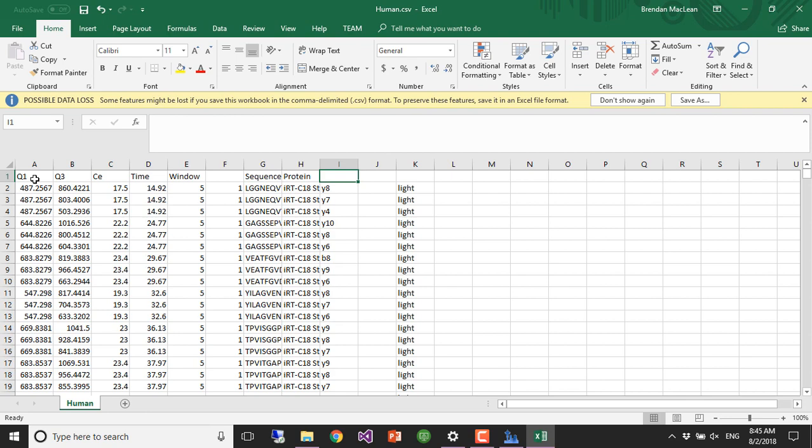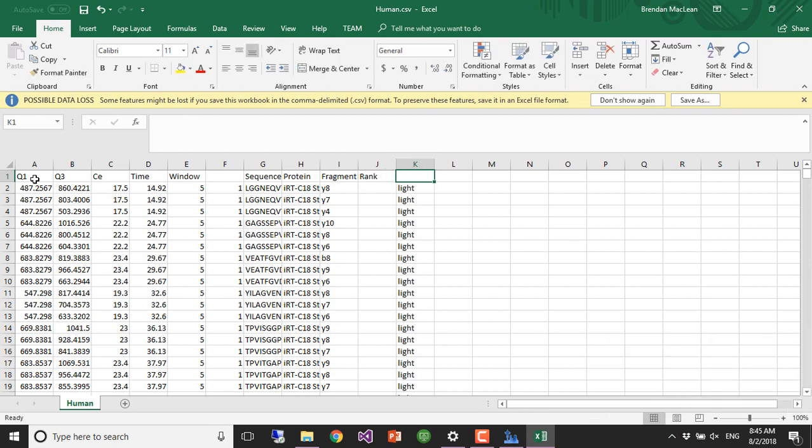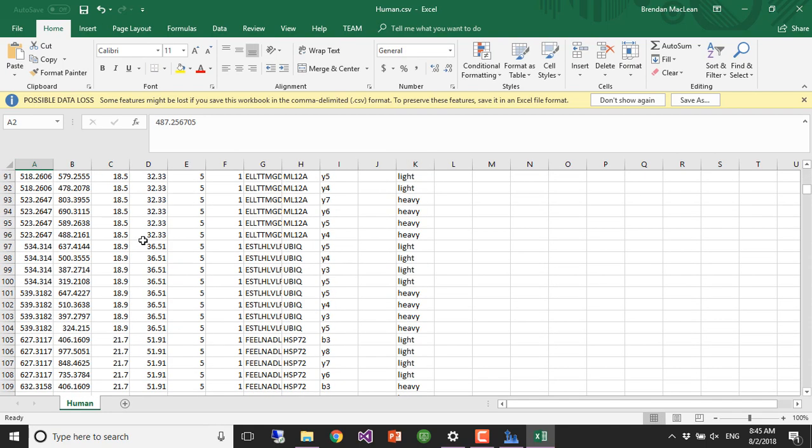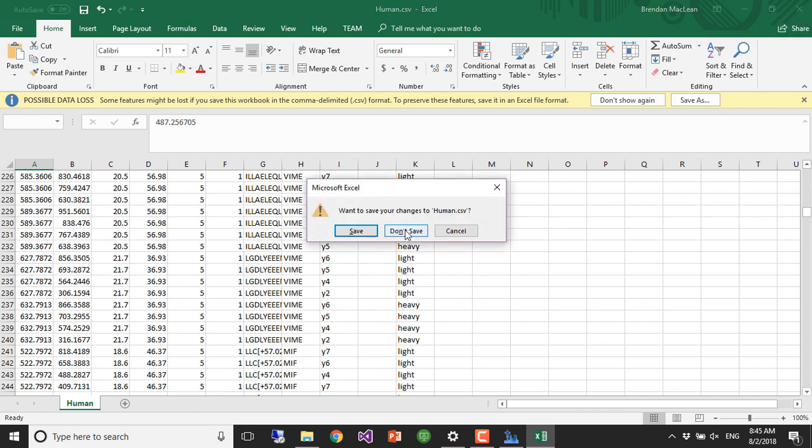protein, fragment, rank, and isotope, ILT, isotope label type. Okay, so we could just import that and run it. And that's what Biognosis did. The main point being that we were able to schedule everything without prior measurement on this column.